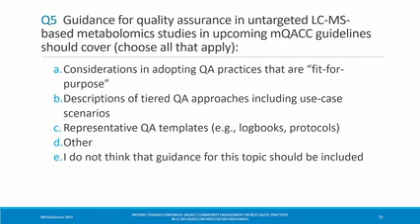Hi, I'm Gonzalo. I'm from the IBBR. And I think as a community, we need to be a little bit careful how we do the fit for purpose. So the QA system is already fit for purpose, right? So it's been developed, it's been applied to industry, to very specific applications.